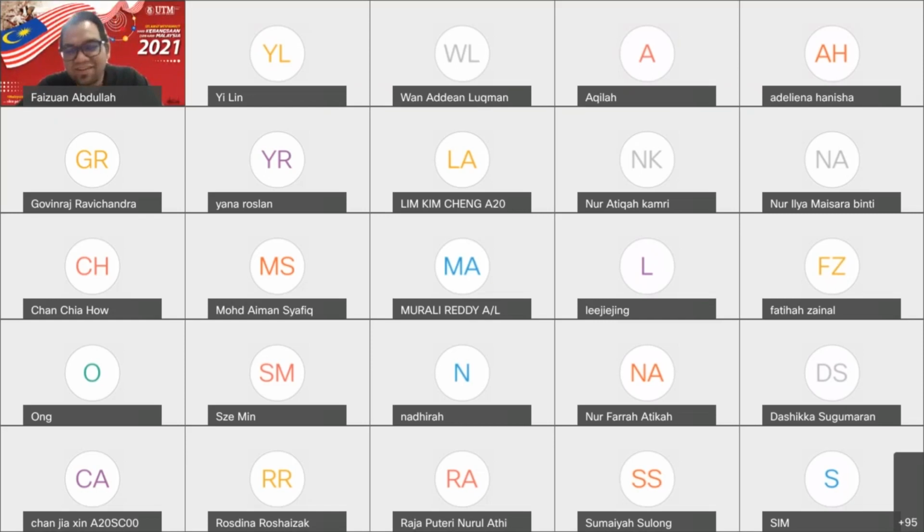Okay, all right. Because in analytical chemistry, analytical biochemistry and so on, in analysis, we are avoiding, right? We have tried our best. We will have to try our best. Remember to avoid the error, human error, systematic error, and all errors, right? Because it's easier for us to make a mistake there, and it will affect a lot the concentration of the solution that we will prepare.